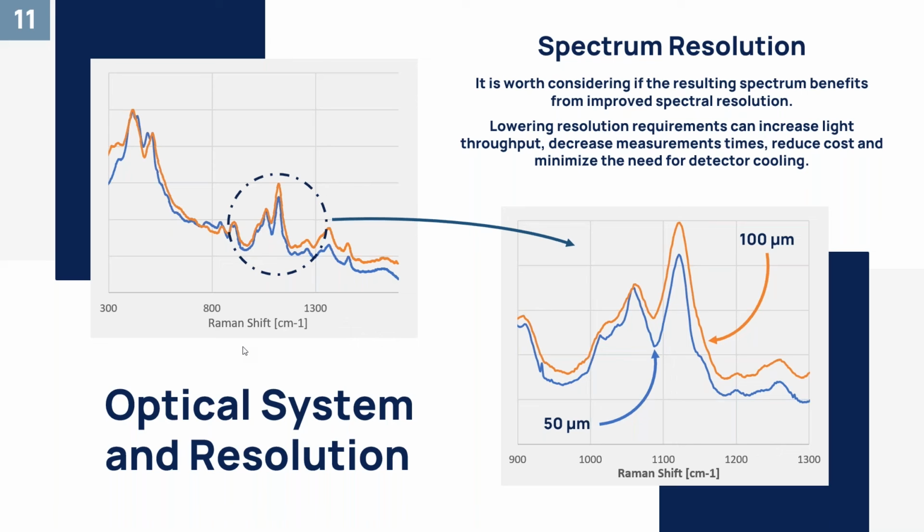And that plays back to the whole thing of looking at what we want to examine as the sample here, and do we need a certain resolution to actually measure that sample or not? Because in Raman, it's very easy to get hung up on needing a very, very high resolution, because most Raman spectrums have these very well-defined peaks, but especially for biological materials or more complex molecules, that's not necessarily the case. So it really pays to look into what a typical spectrum would look like.